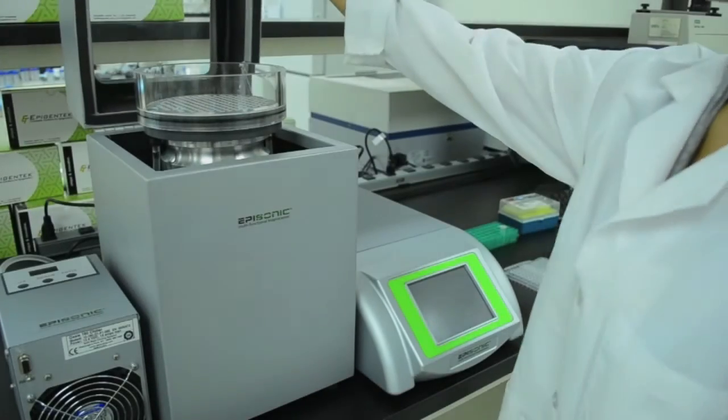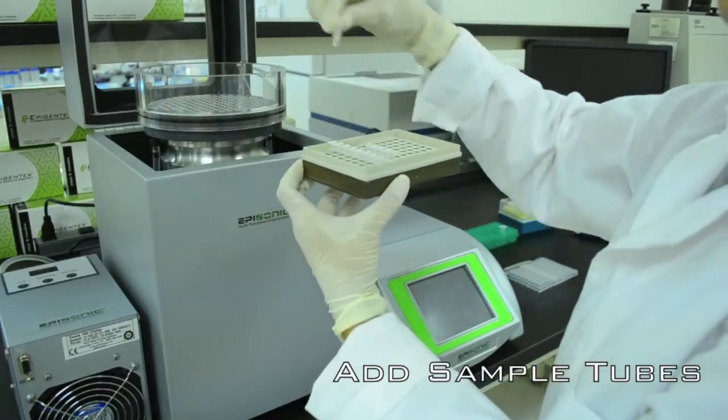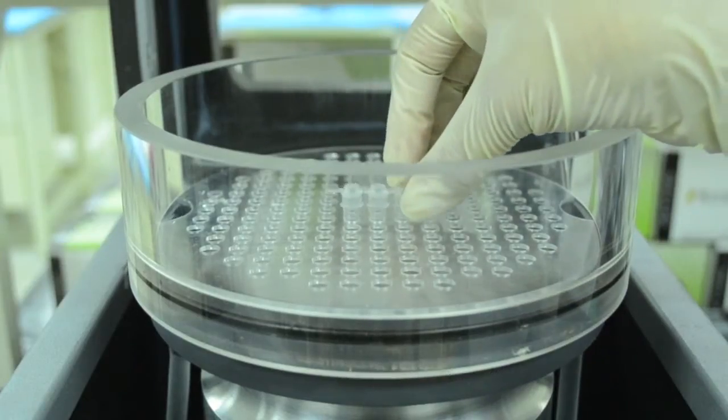Once the water is sufficiently chilled, you may now insert the tubes into the rack. The closed vessel processing prevents sample contamination.